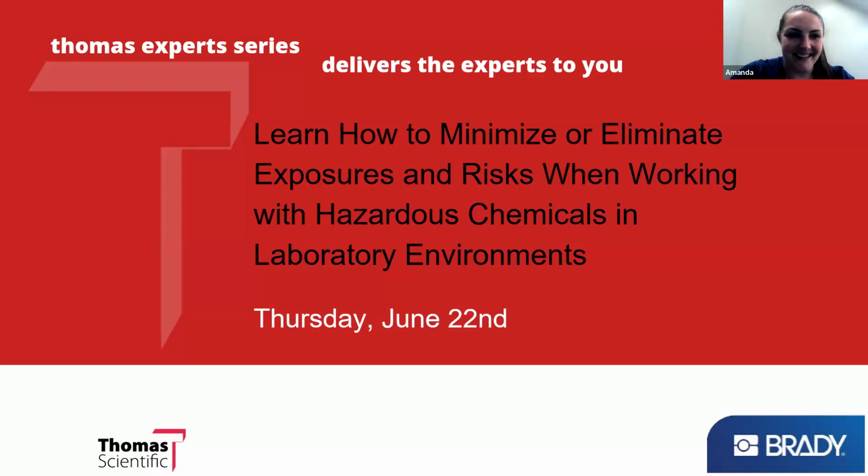We're excited today to talk about labs. So we're going to discuss a brief overview of OSHA's lab standards, and then we're going to dive into identifying your safety needs and solutions. Then we'll discuss an industry best practice, 5S plus. Lastly, throughout the presentation, we're going to just briefly talk about some solutions that Brady offers.